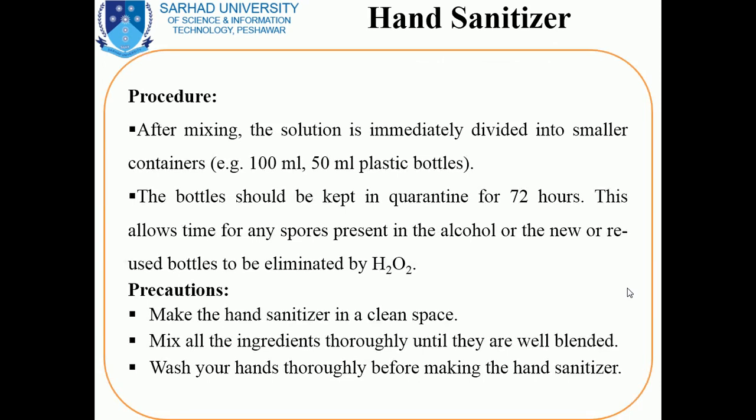After that mixing, the solution is immediately divided into smaller containers. For example, if we want to make 100 ml in each bottle, then we will transfer it to 100 ml bottles. If we want to make it 50 ml, plastic bottles will be there, and we will transfer it immediately into the divided containers from the final or stock container.